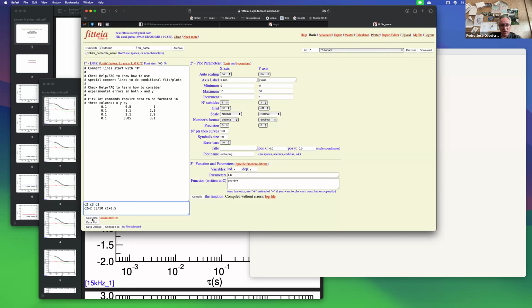And on the second one, I will multiply the first column. After this process, column number 2 will be placed as the first one. So this one here is C2. After the first step, it will be C1. So I will be multiplying that C1 by 2. And the same thing for the others.